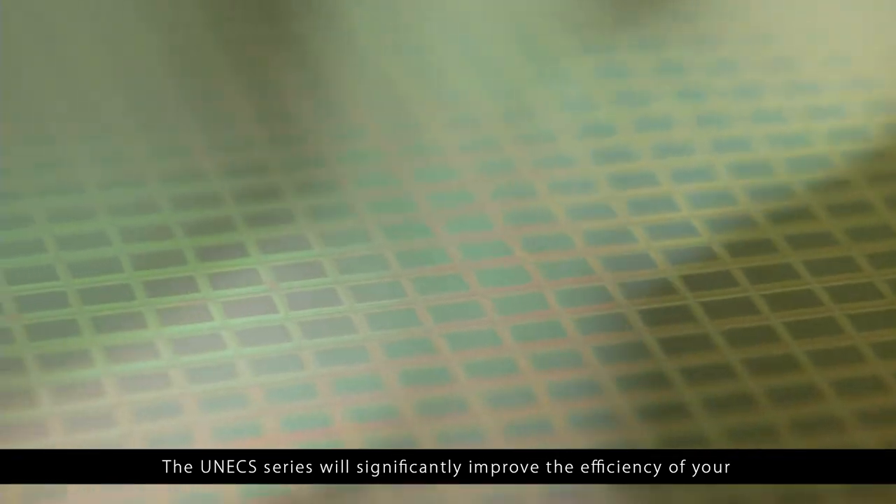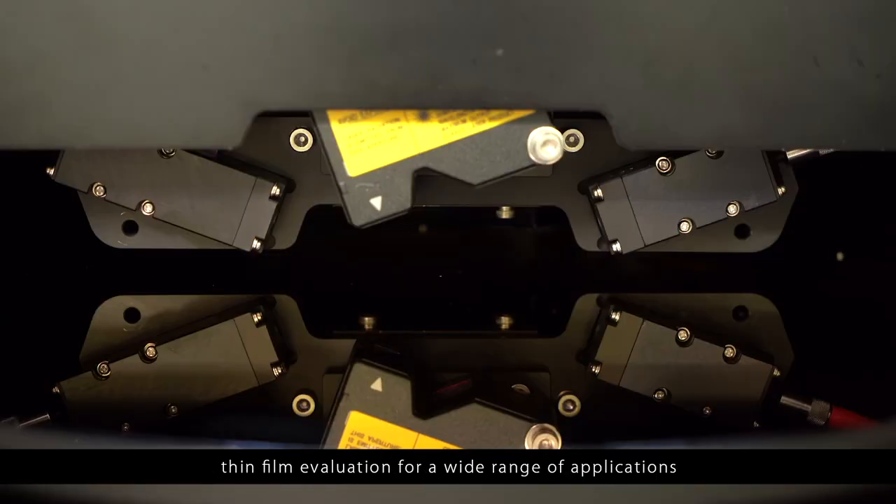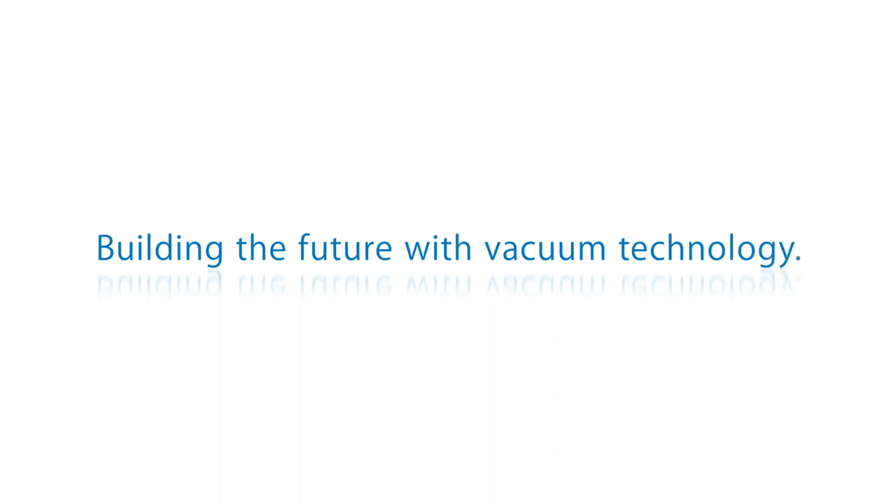The UNECS series will significantly improve the efficiency of your thin film evaluation for a wide range of applications. Building the future with vacuum technology. ULVAC.